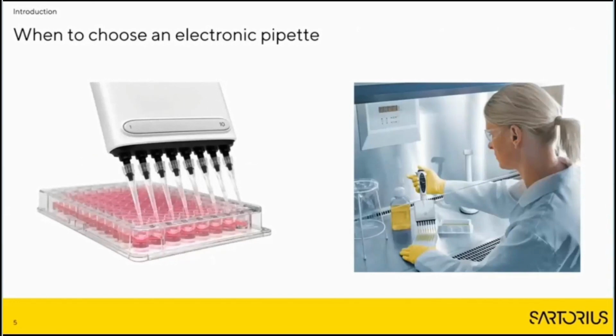A lot of laboratories we've seen have dozens of pipettes, but typically only a few tend to be electronic ones. There are exceptions, of course. We've seen labs that are fully equipped with electronic pipettes because of the benefits you get, but very typically only a few of them. We've seen, especially when preparing 96 and 384 well plates, users tend to move towards electronic pipettes because they reduce human error and increase throughput.